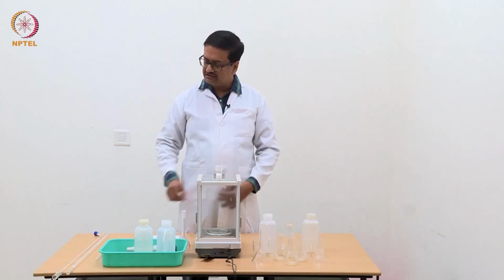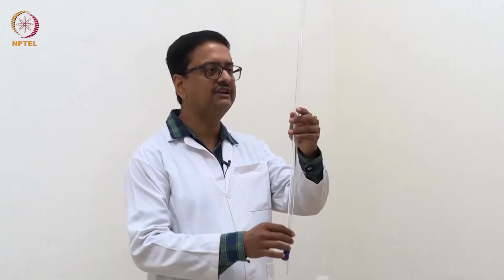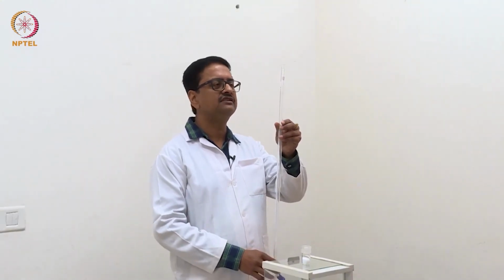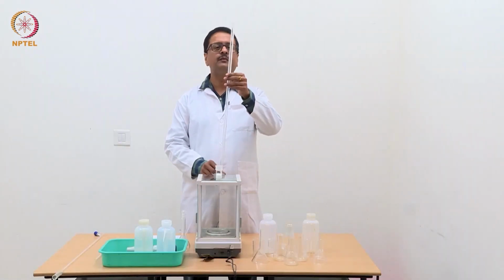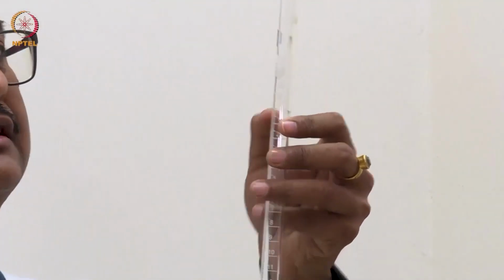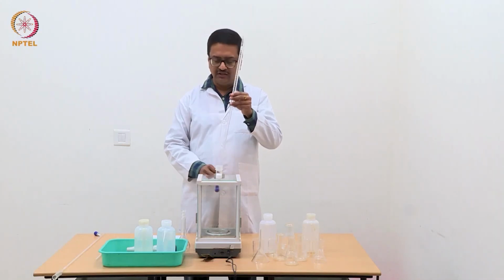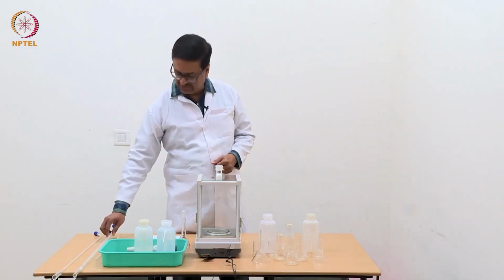To do the titrations, you will need a burette, which I am showing here. This is a 50 ml burette, which you can see on your screen, and it measures 1 ml, with that 1 ml divided into 10 parts. So the smallest amount that can be dispensed from here is just 0.1 ml. We will use this burette while doing the standardization experiment.